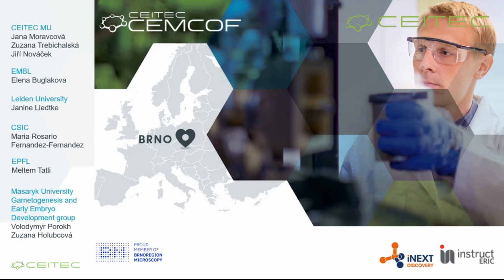Very interesting talk. I have a question on the actual milling source. You showed different sources, from gallium ions to different gases. Have you also looked at the surface topology of your milled section? Do different sources affect the local etching rate of the surface?